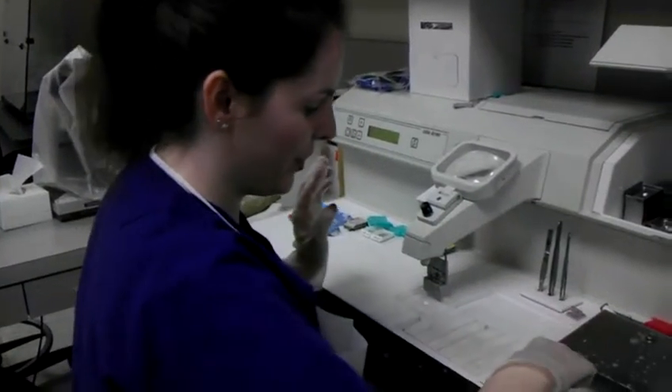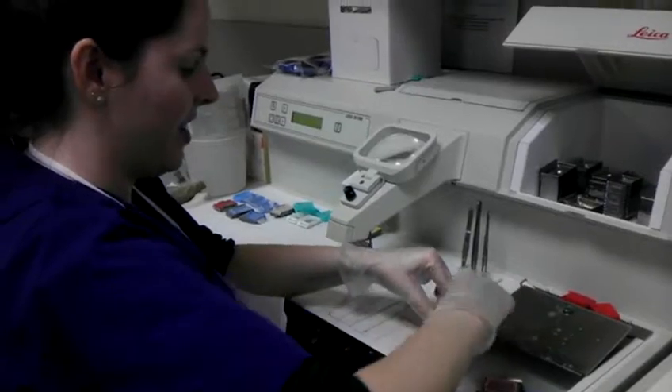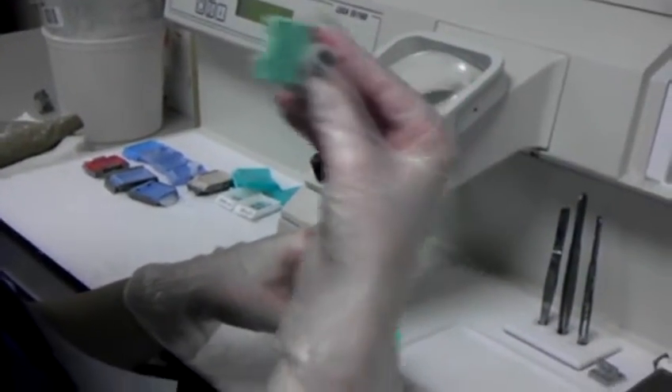This video will show you how to embed tissues. First, you're going to pull out your cassette, then open your cassette and check to see if there's any tissue left on the top — which there's not — so you throw it away.